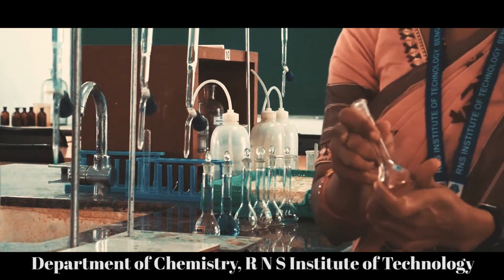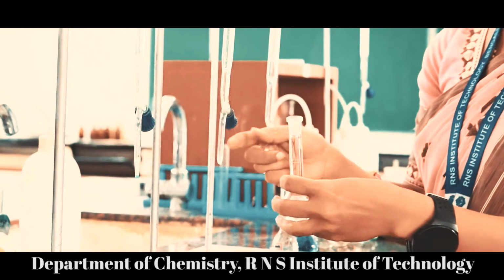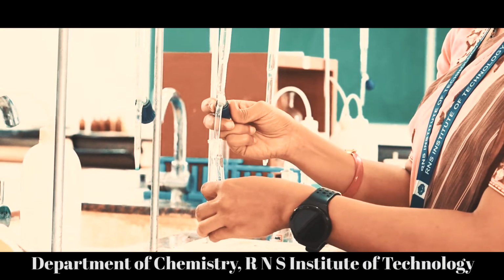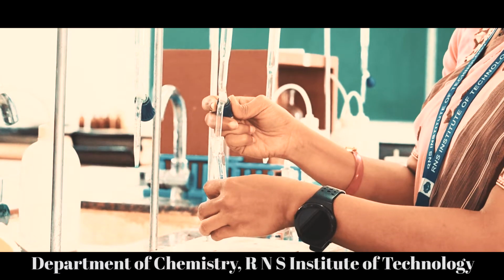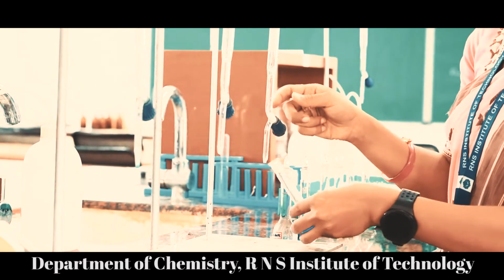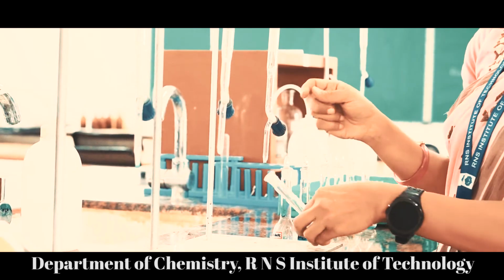For flask number 4, we are adding 4 ml of copper sulfate and 2.5 ml of ammonium hydroxide. Dilute the above solution with distilled water and make it up to the mark.